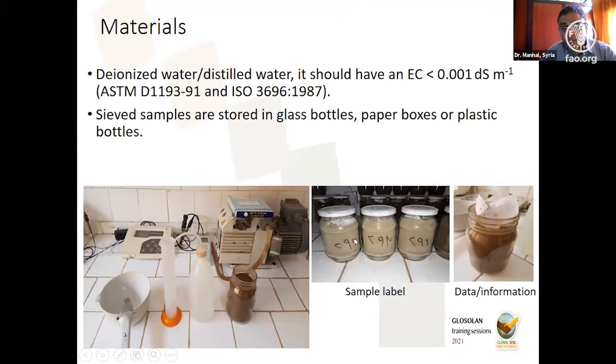Don't forget to write the numbers of the samples on the bottles, and also don't forget to put a small piece of paper into the sample bottles to keep the information, to keep the data, and don't forget to record all this information in a register or personal computer to save this data for future work.